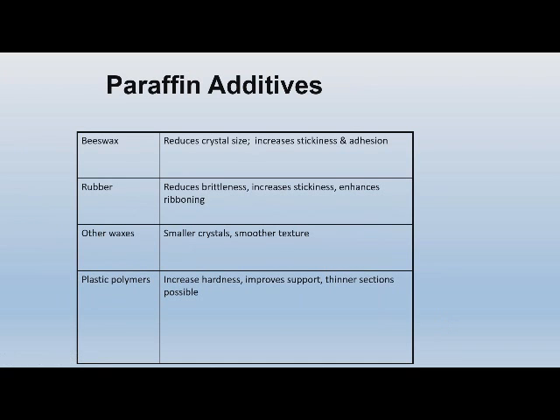There are many paraffin additives. In our current situation, most of them are plastic polymers. Back in the old days when I was in histo school, we used candle wax, and we would put beeswax in it to reduce the crystal size. It would increase the stickiness and adhesion.